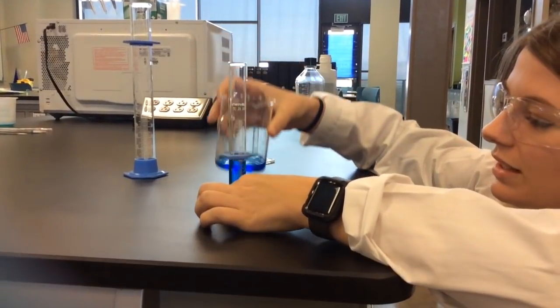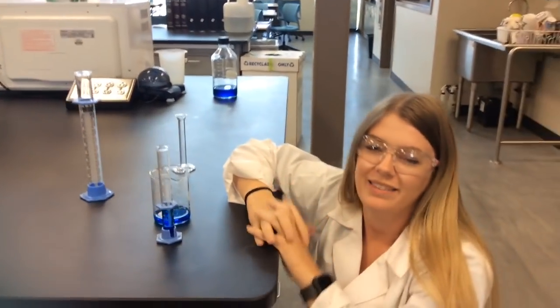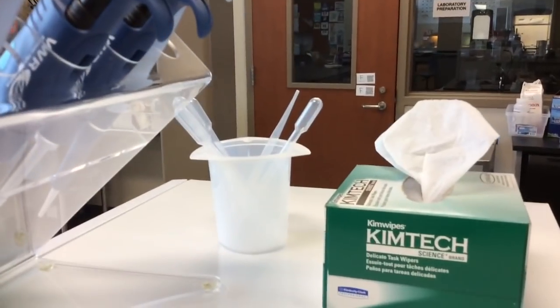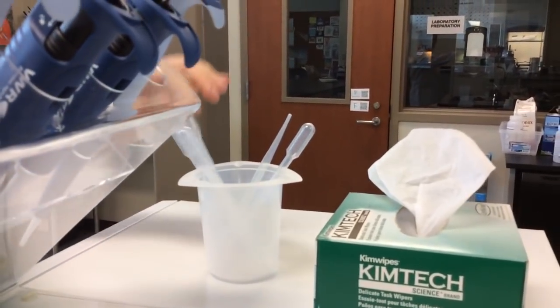Another really awesome way to do this is with those pipettes that are currently over there. Let's go get one. Let's grab one. If you ever need a transfer pipette, there should be some on your tabletop. Yeah, so this pipette.